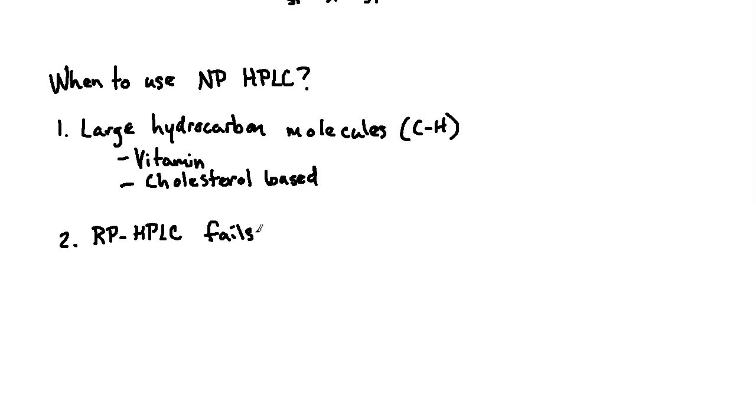But most people are going to go to reverse phase to start with, and there's multiple reasons for that. It's not just that the column is nonpolar and that the mobile phase is polar, but think about the cost base. If you're using water as your primary solvent for an HPLC system in comparison to hexane, and this is getting a little bit of a preview into the pros and cons category, obviously one of those is going to be far more affordable than the other, right?